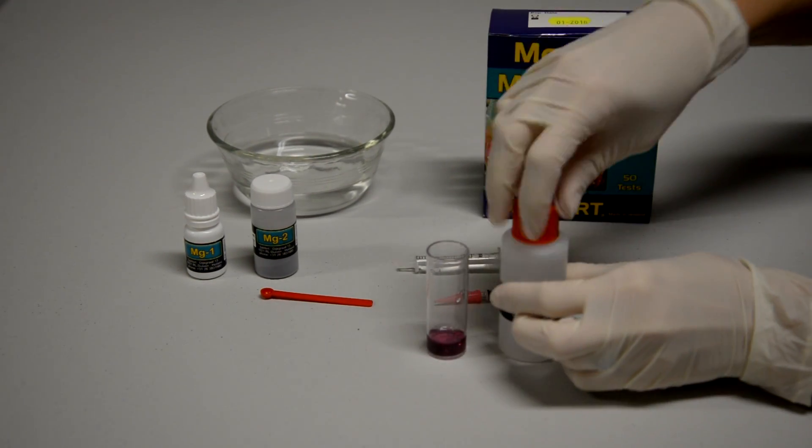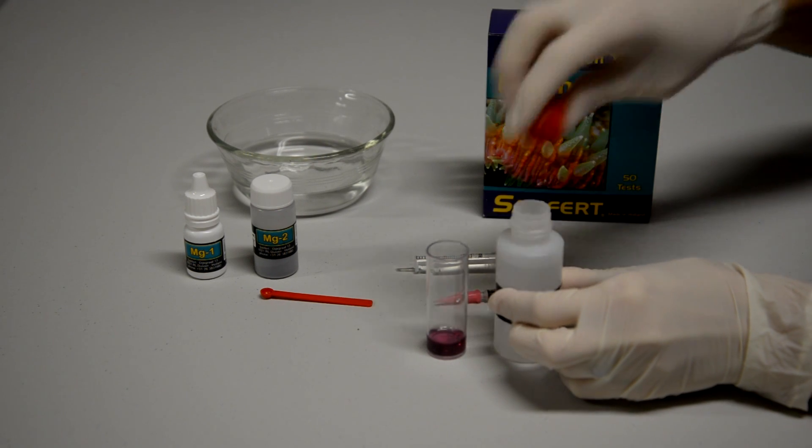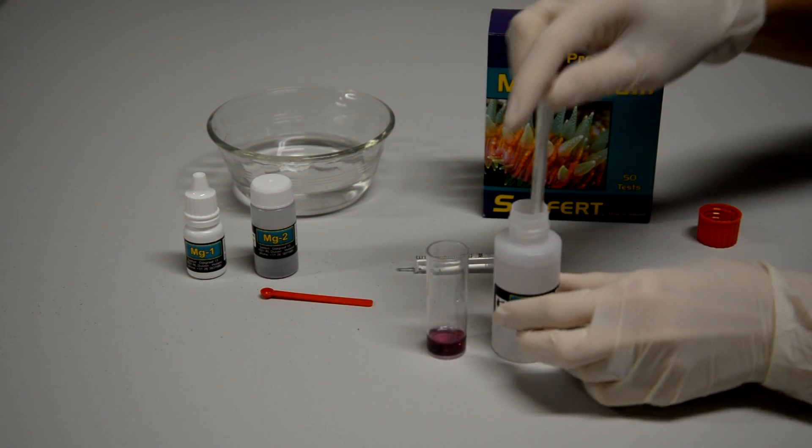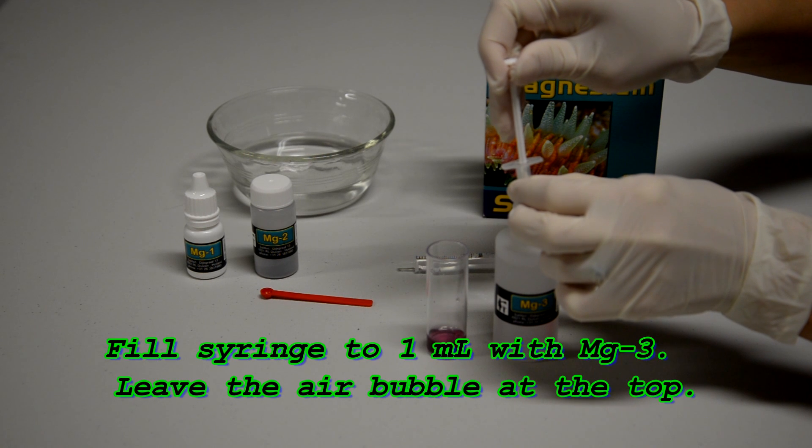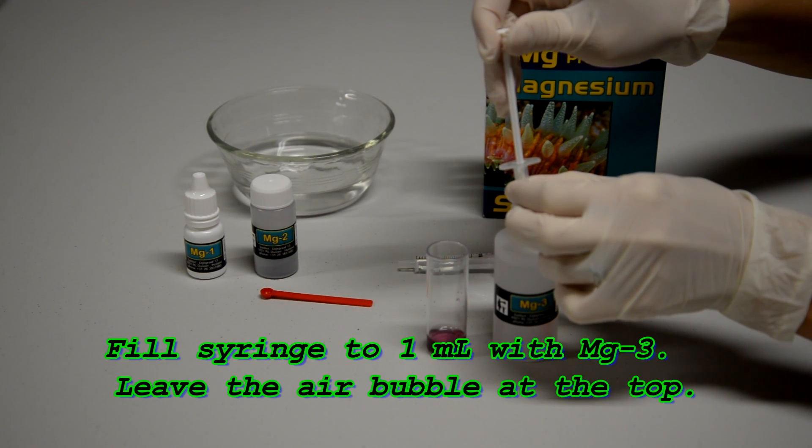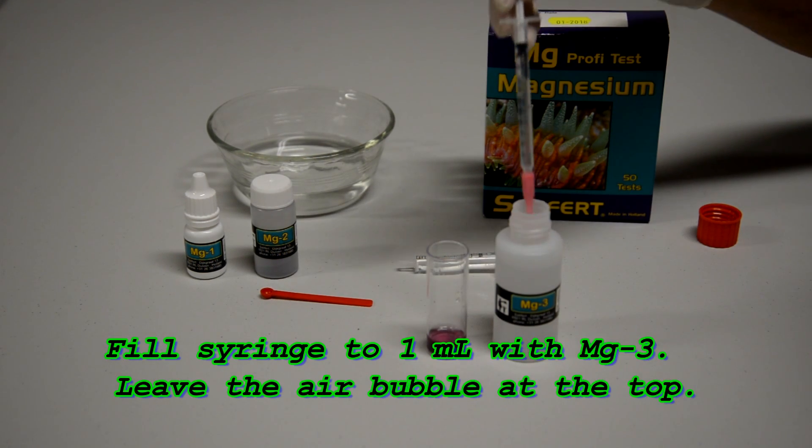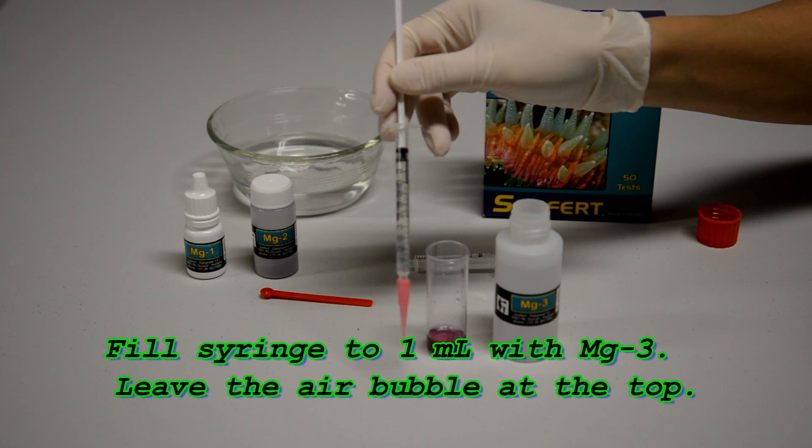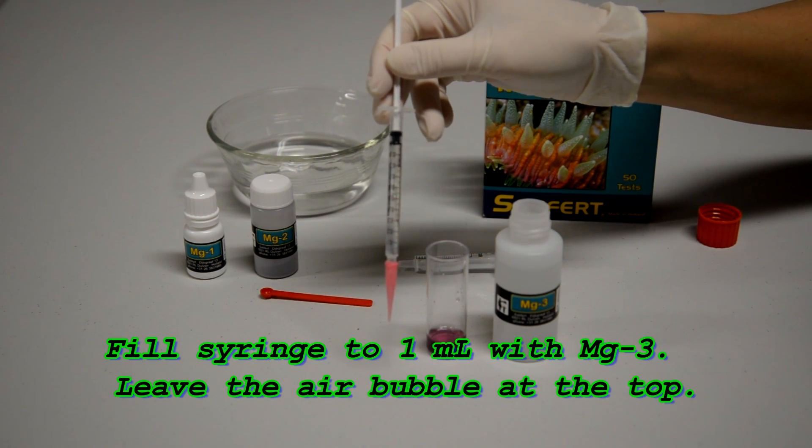Then you're going to fill up your syringe with the magnesium 3 solution. Fill it all the way up so you get one full ml in your syringe and be sure that you leave that air bubble at the top.